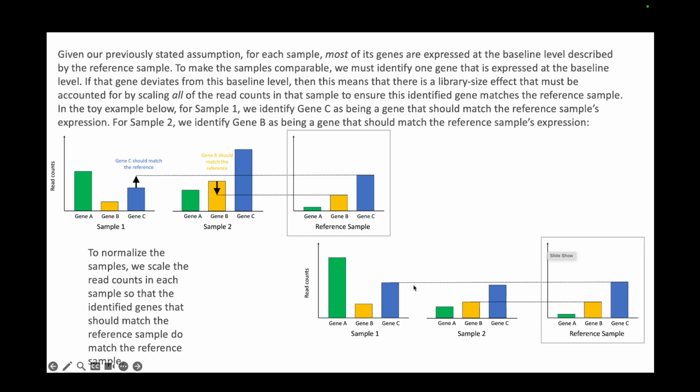You compare anything and then you scale up and down depending on the expression level, and then you compare both samples. This is an interesting way to do it.